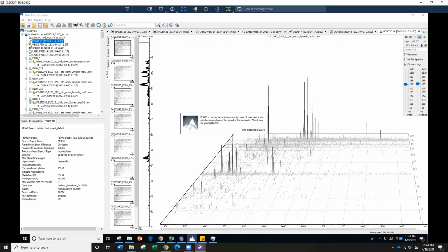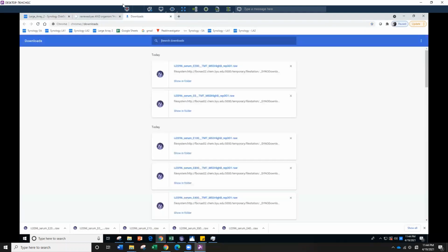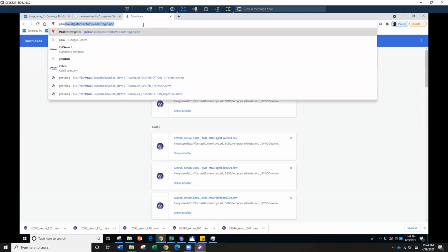The good thing is, if you ever have questions and you could not find any grad student on campus that knows the answer, you can always call PEAKS Studio. They are really responsive in answering your questions.